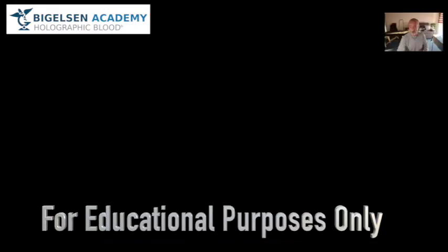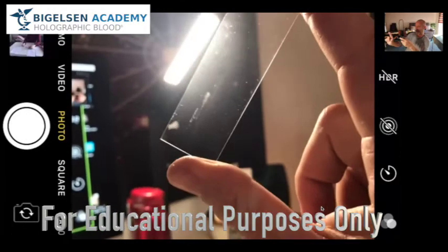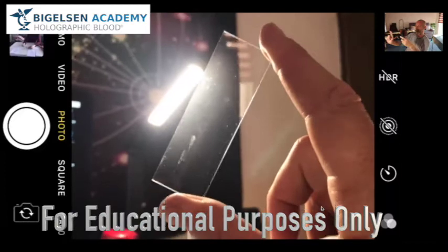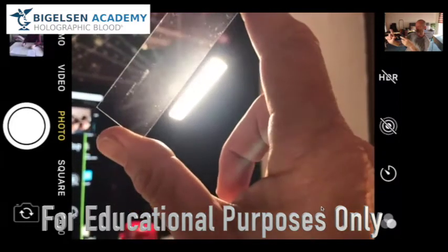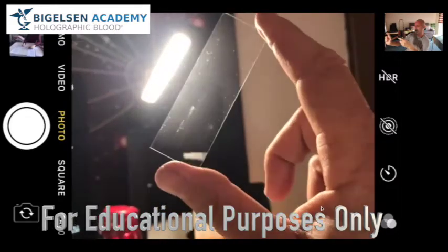The question is, how do you see this? I'm going to do a screen share. Look at the light — I don't need a microscope to see this dirt. Am I irritated? Yes. How do we do science with this? ThermoScientific, you should be embarrassed. I have to hire somebody to clean these for me when your slides say pre-cleaned. And this is pre-cleaned — can you imagine what they look like if they weren't pre-cleaned?